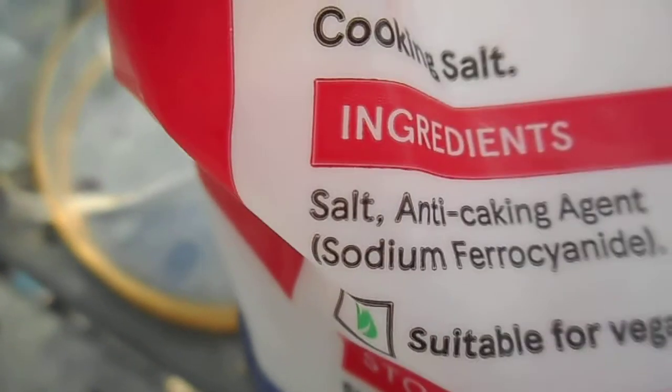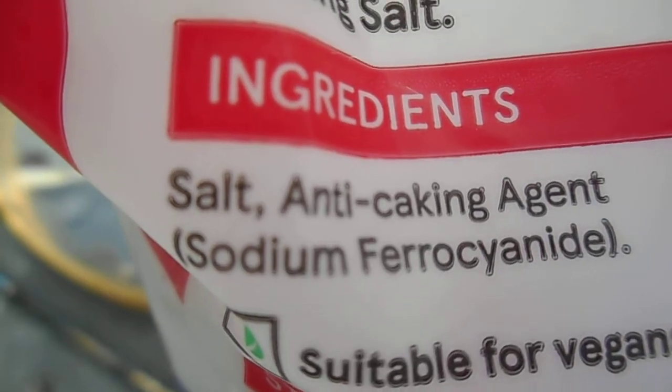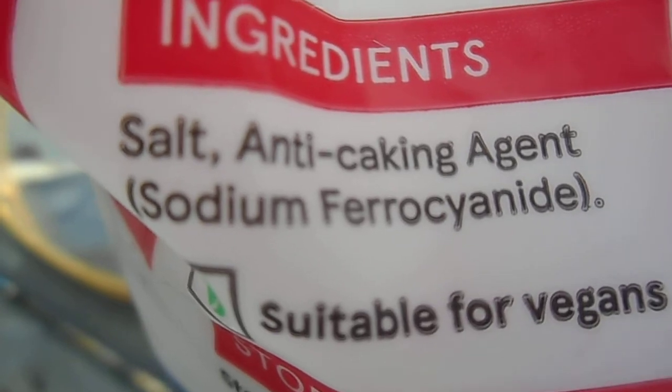Now let's look at the crystals from cooking salt. What shape are these crystals? How do they compare to the sea salt crystals? The cooking salt has an anti-caking agent, sodium ferrocyanide, added to it. What effect does this have on the shape of the crystals?